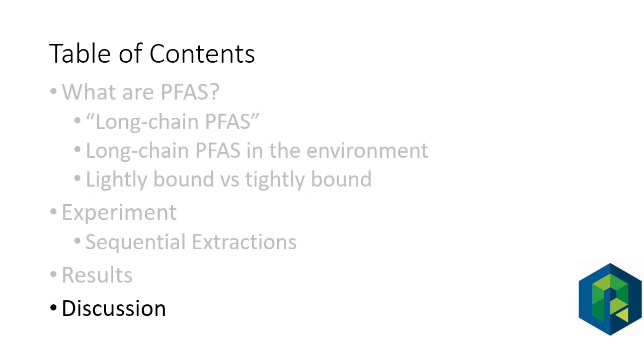So let's do a little bit of discussion as to some places that we've gone since then, and some things that we've managed to do with the ASE.